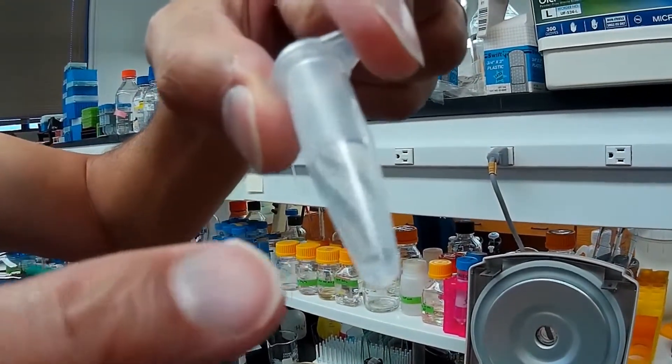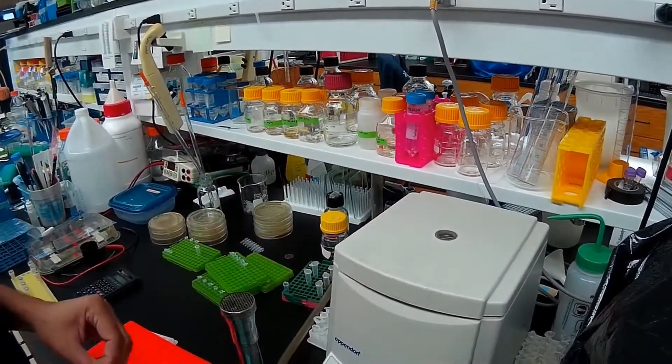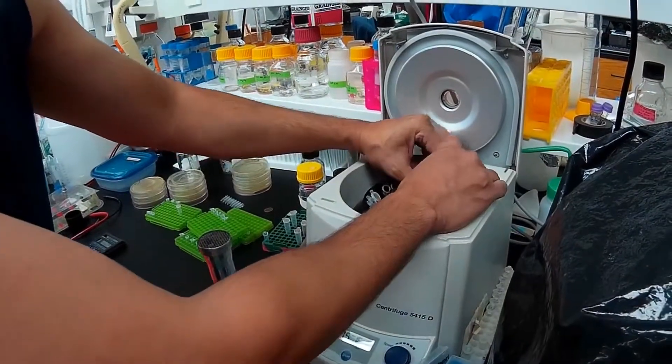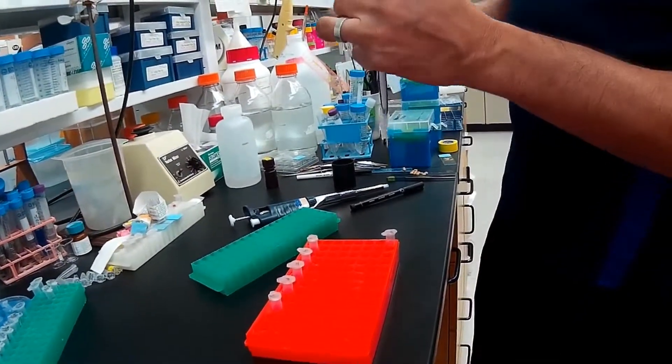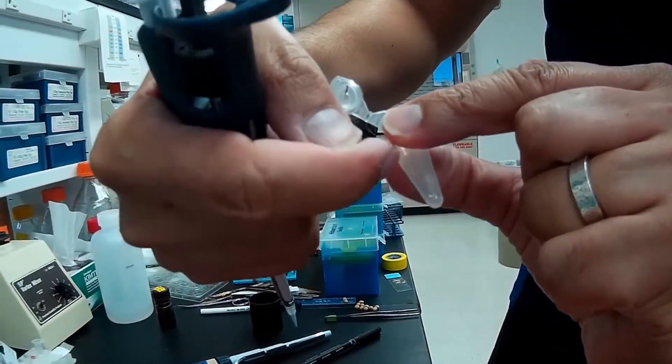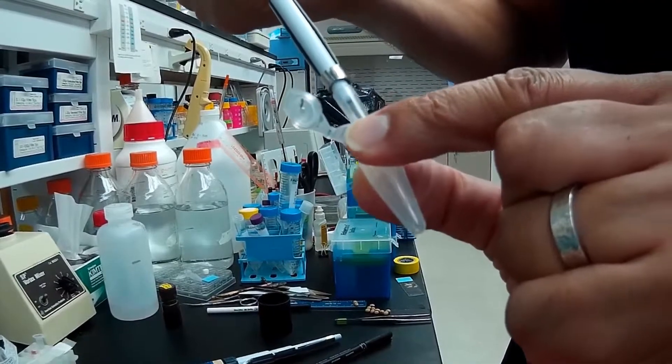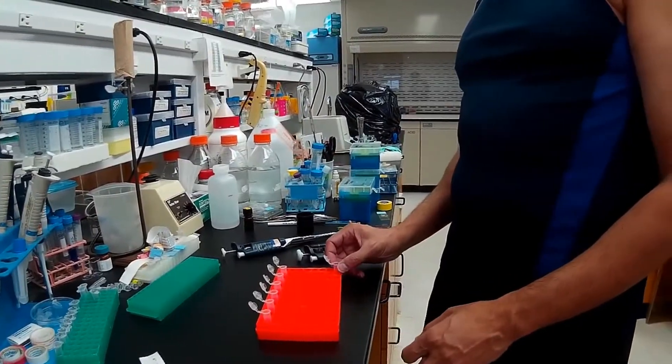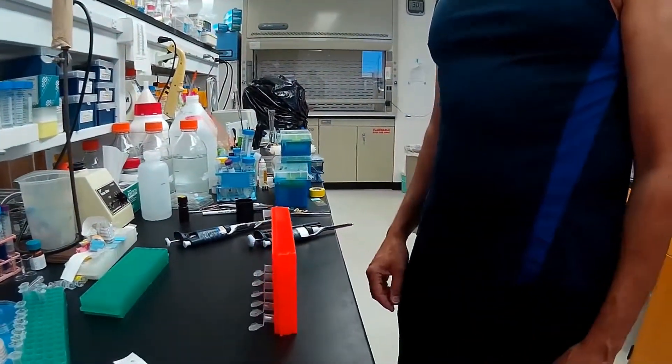Spin the tubes down again for five to ten seconds to collect the residual ethanol at the bottom of the tube. We'll use a pipette to remove the remainder of the 70% ethanol. This way we'll have no remaining ethanol in the tube. Again, stay away from the pellet. Pipette on the opposite side where the pellet is. There, now the tube is almost entirely dry. To further dry the tubes, we can put them on their side for about one minute, one to two minutes.